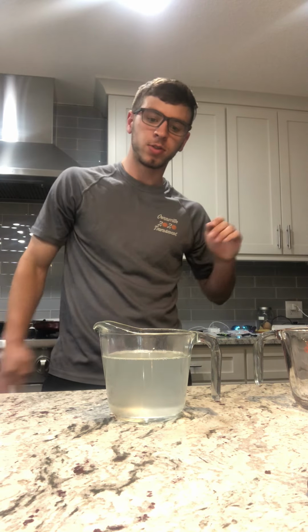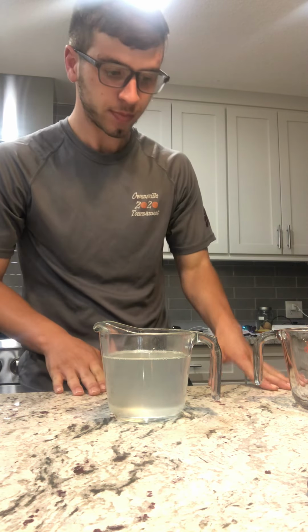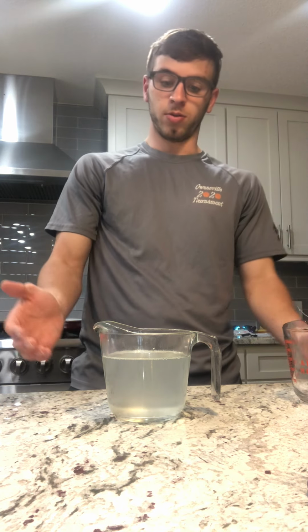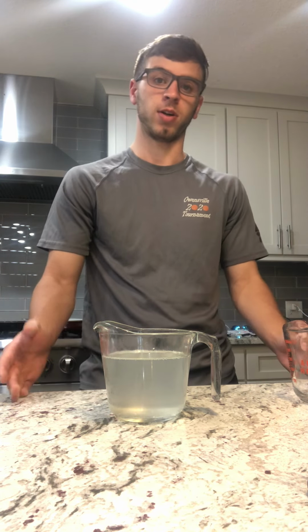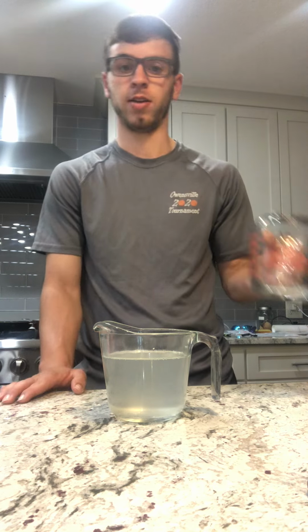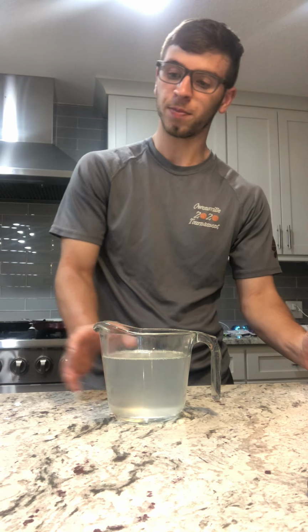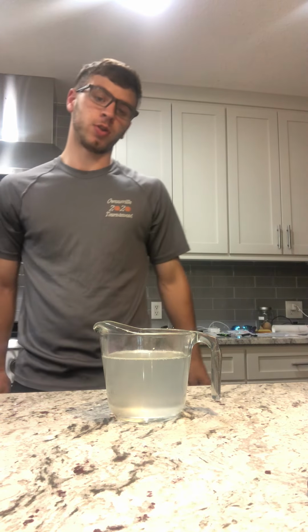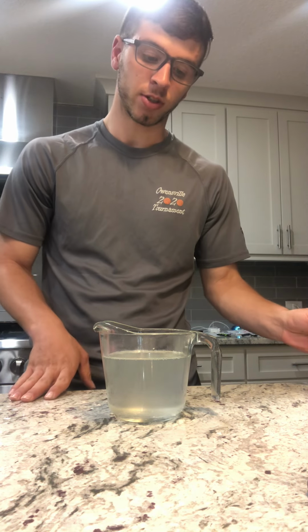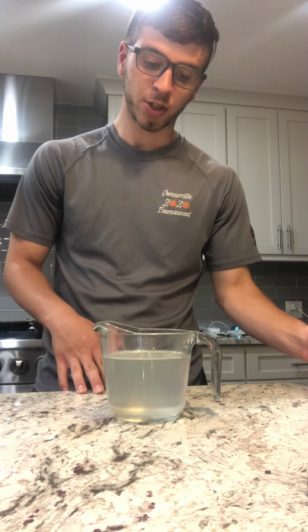Okay guys, so what I've just done is I took a solution of vitamin C and water from this beaker, put it into this beaker with a solution of hydrogen peroxide. Sorry, this was vitamin C and iodine. This one was hydrogen peroxide and water. So I just poured this into one beaker and mixed the two solutions, and now we're just waiting for the reaction.